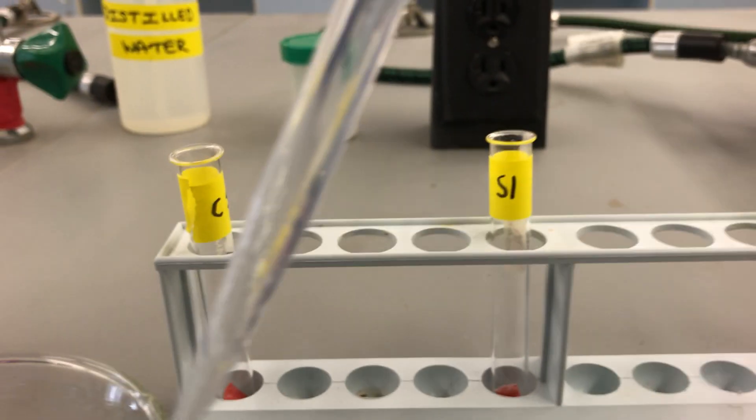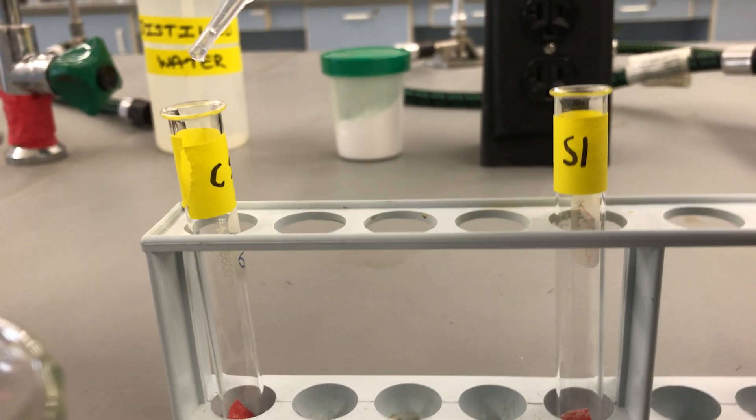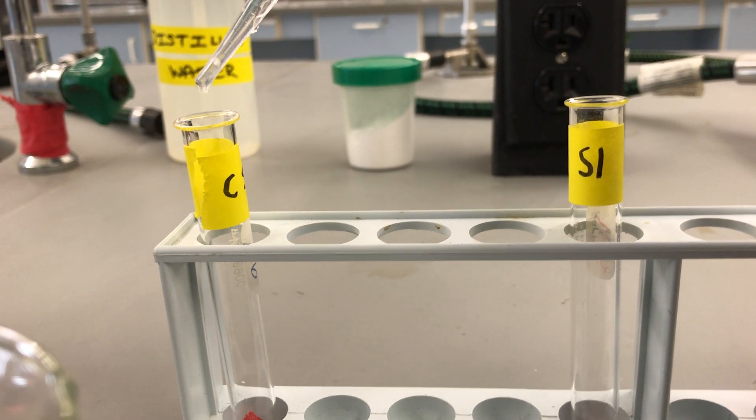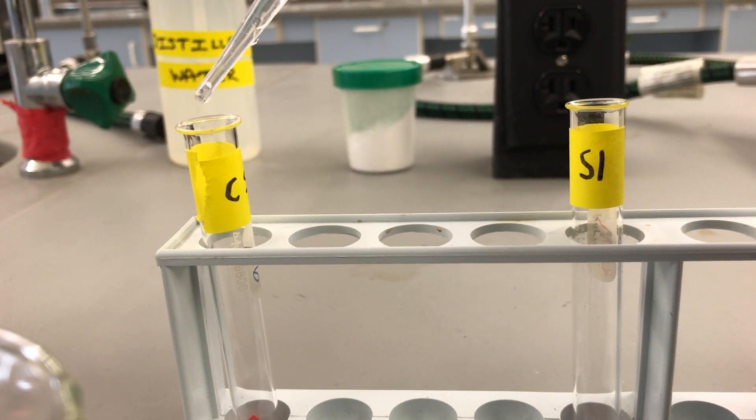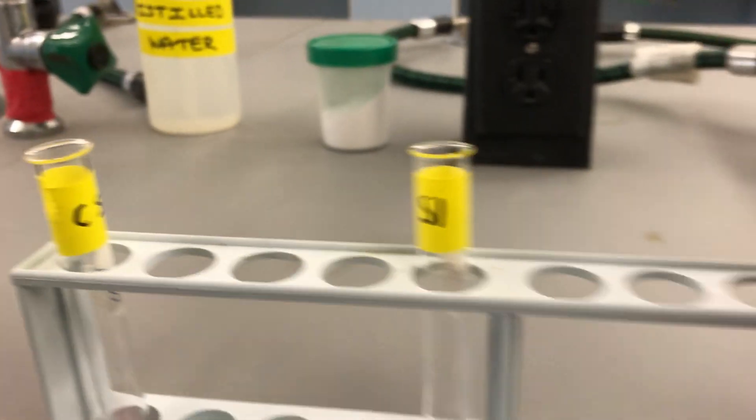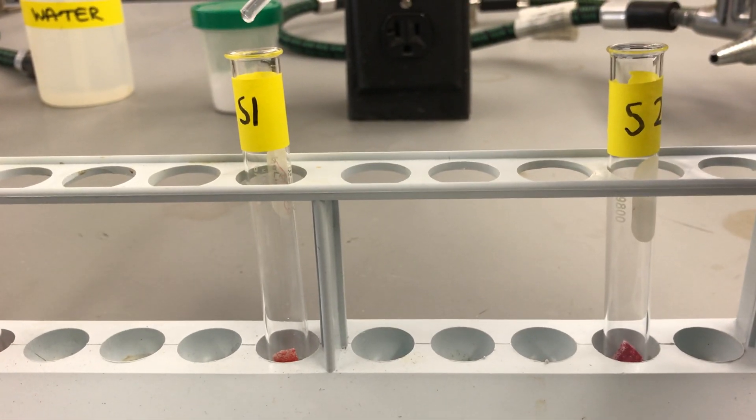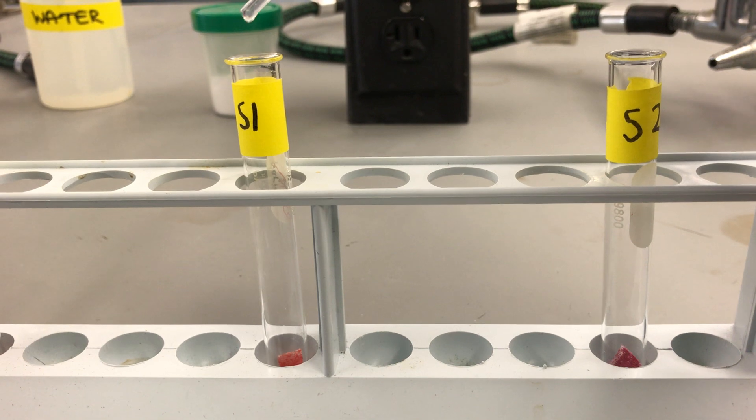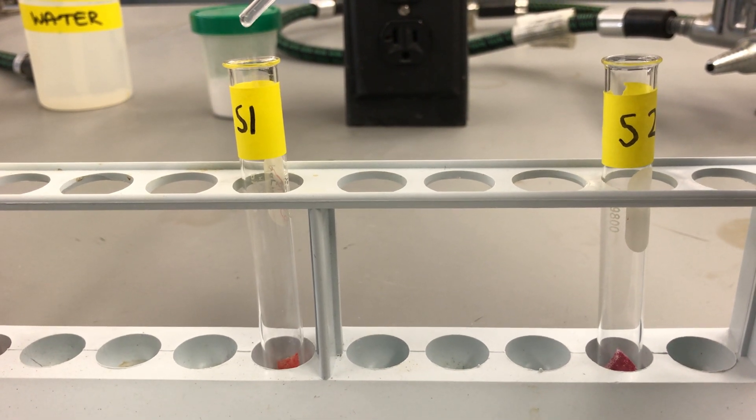We're then going to add about one, two, three, four, five, six, seven drops of our bottom layer to each test tube. Two, three, four, five, six, seven.